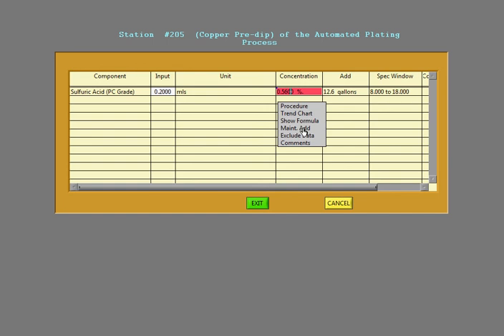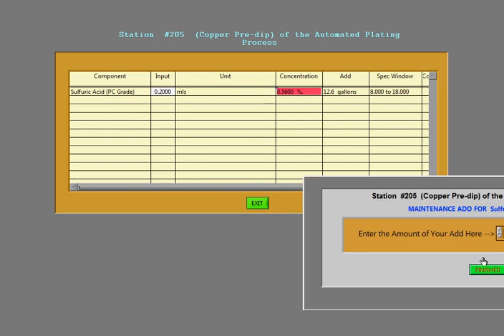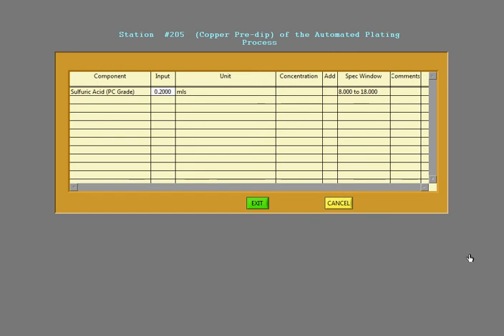And the maintenance add screen. You can actually do a maintenance add if you want. So we'll go over these in future videos.